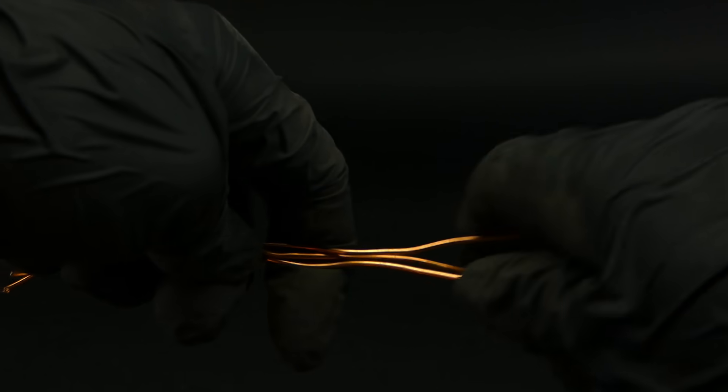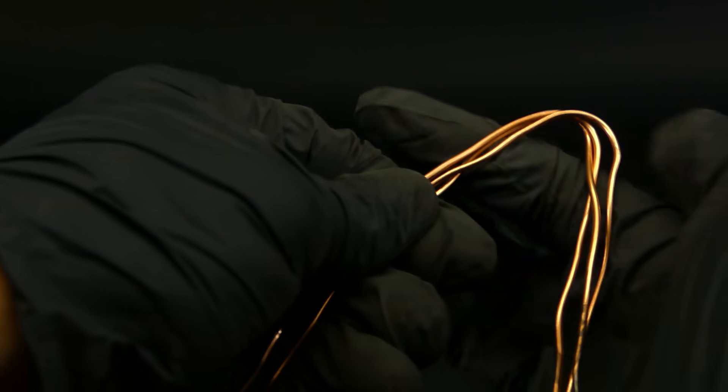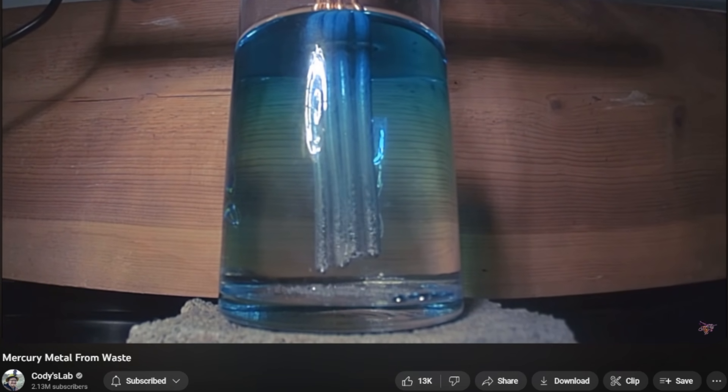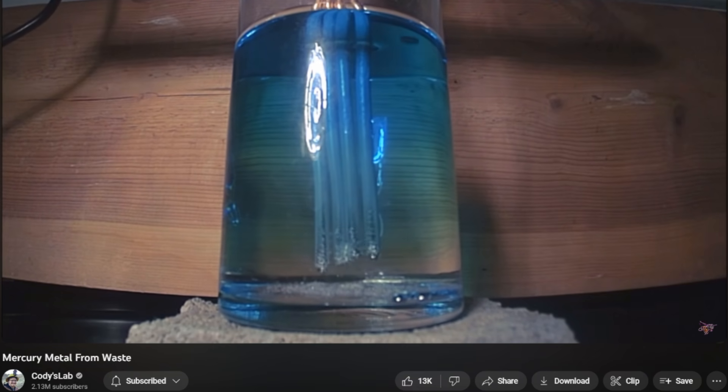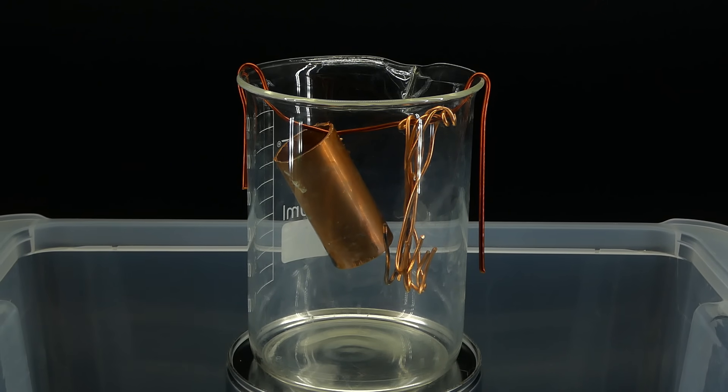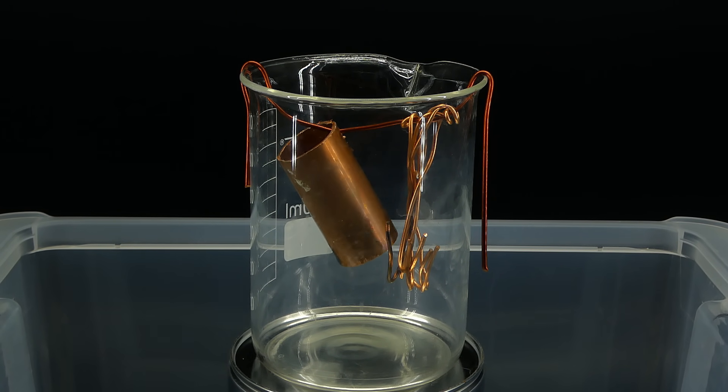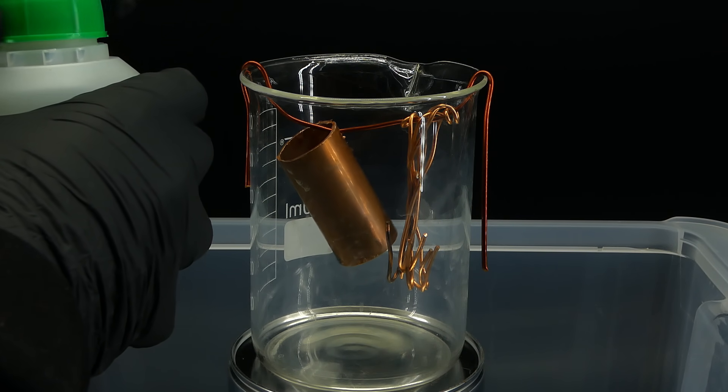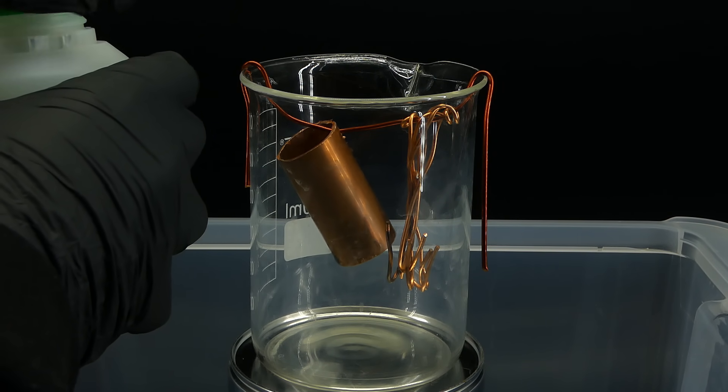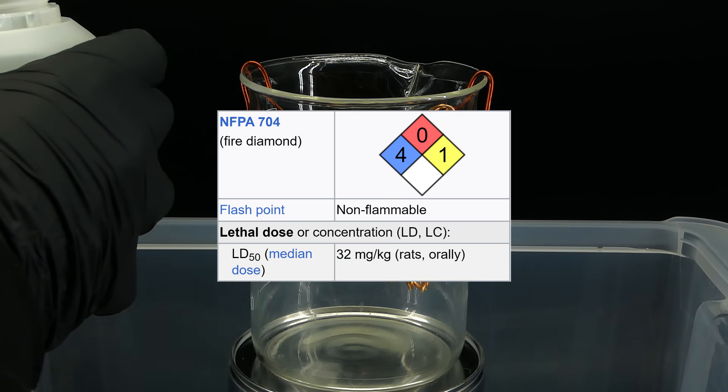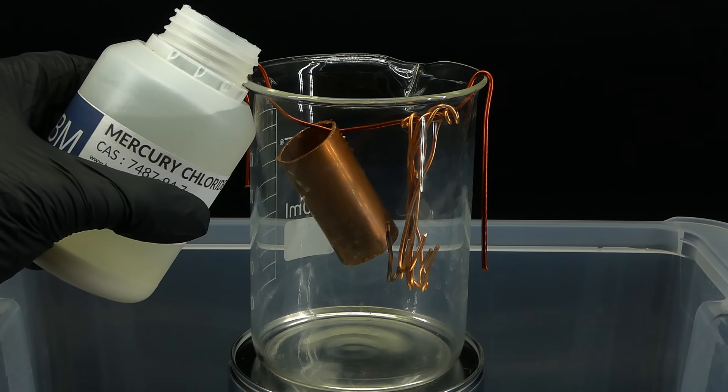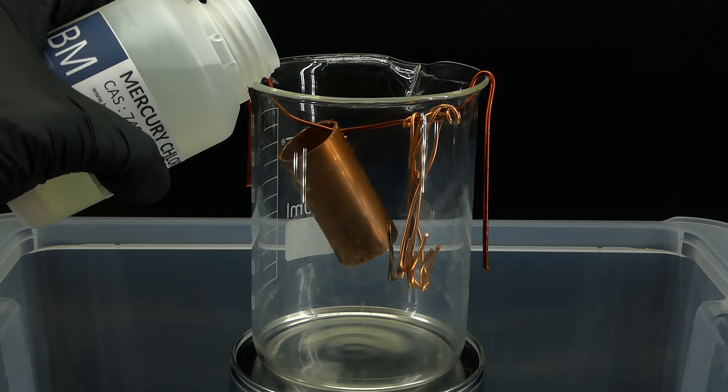As the more reactive metal, I chose copper, because it is pretty easy to get, and I saw a video by Cody's Lab who used it to reduce mercury nitrate to elemental mercury, so I thought that it would work the same for my mercuric chloride. To test it out, I now had to make a DIY mercuric chloride reducing contraption, but before I could do that, I have to put some safety gear on, because this project is by far the most dangerous one that I had ever attempted, and I wanted to ensure that I actually survive to make more chemistry videos.